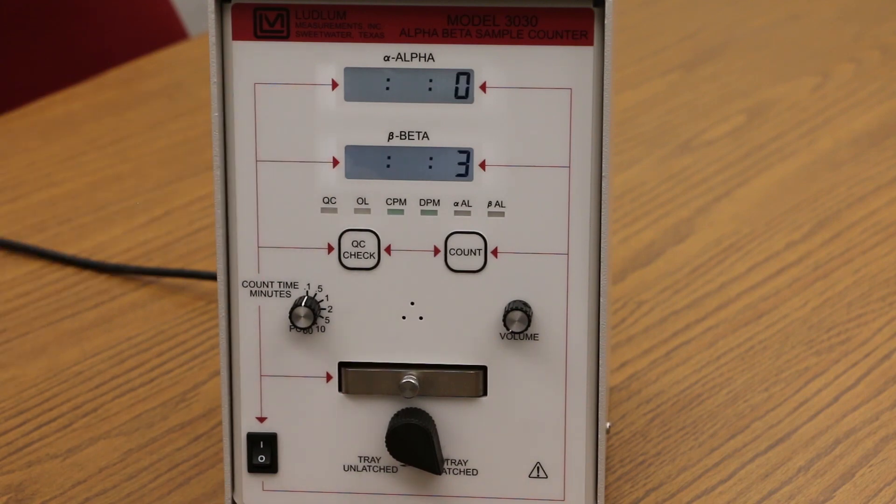Colons will be displayed during the count. At the end of the count the colons will disappear and the total number of counts received in the alpha and beta channels will be displayed.